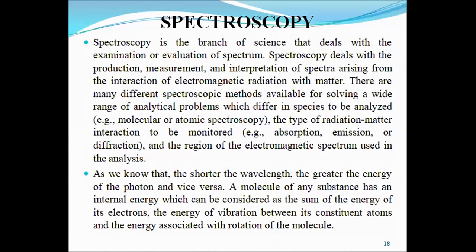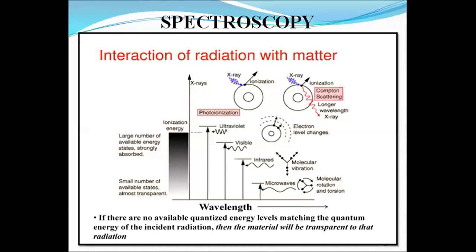To obtain the spectrum, we need a light source, a monochromator and a detector. The apparatus is called a spectrometer or spectrophotometer. The spectra can be obtained either as emission spectra or as absorption spectra. The details of this we have already covered in the previous lecture on Beer-Lambert's law. When the absorption occurs in the UV visible region, it is called UV visible spectroscopy.